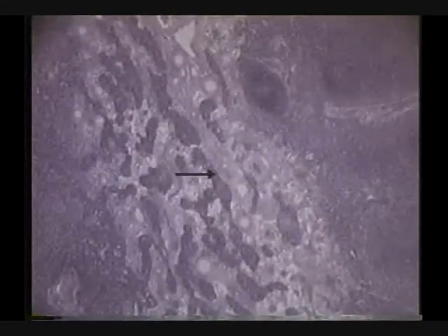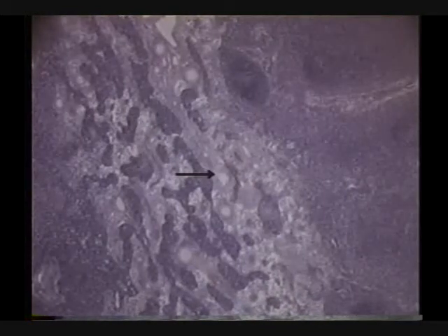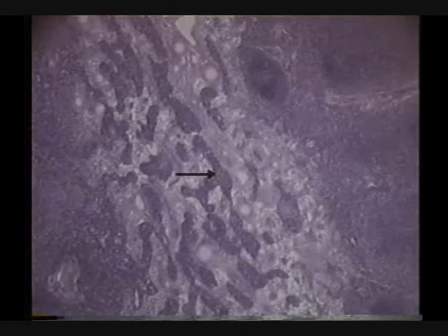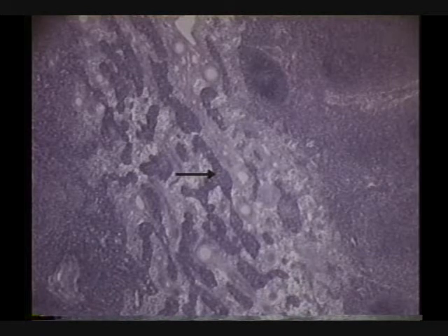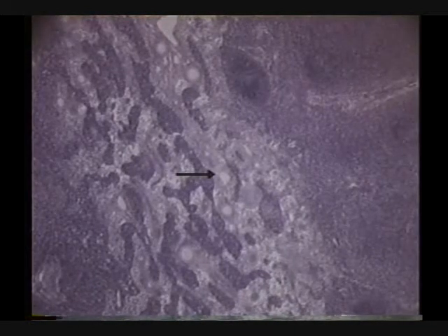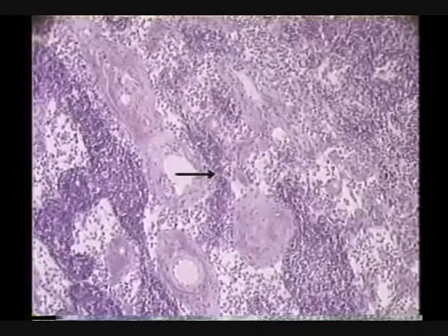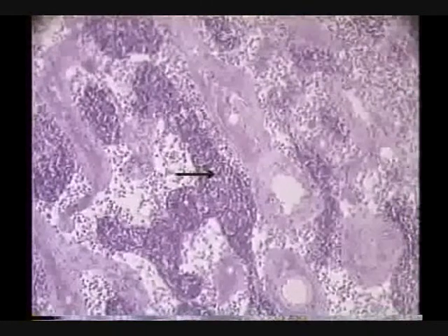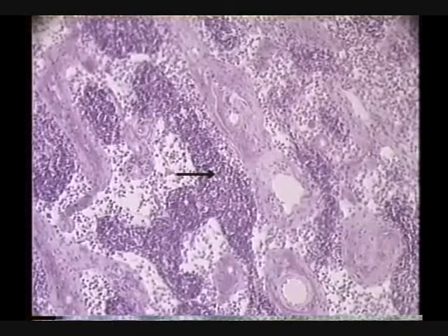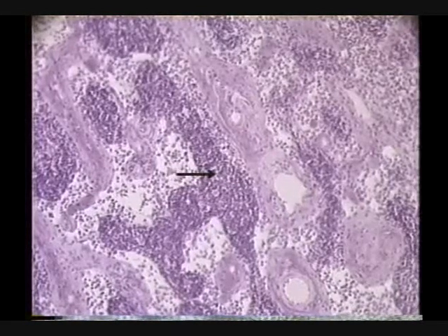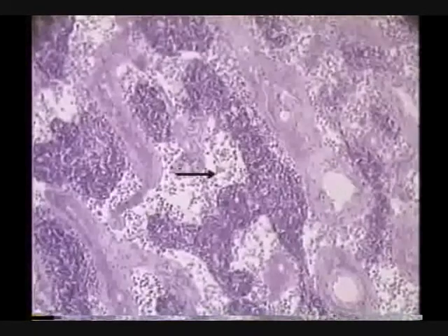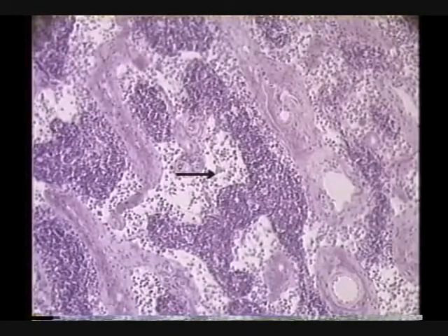Moving down to the center here, we're getting into the medulla. So we've got capsule, cortex, medulla. The medulla has medullary cords and medullary sinuses. The cords are dense bands of macrophages, and the sinuses are where the lymph is going to be flowing through. Here are your medullary cords of macrophages and here are the sinuses through which the fluid flows.